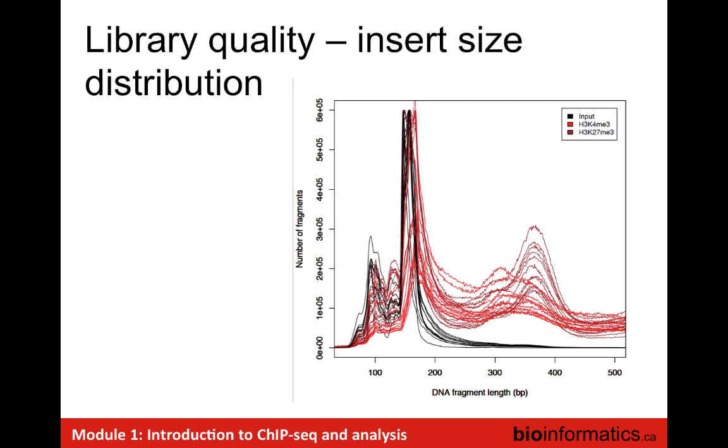Say that again? You do an enrichment on certain fragments depending on the marks that you're looking at. Right. So that's interesting, right? So for example, though you can't see the difference in shades, you can see that actually K27 trimethylation, right, Polycomb, is enriching for bigger fragments, larger fragments. Even though this is what it was presented with, this is what came out, right? And remember that we're giving it a distribution of fragments, right? And so of course these fragments were present in the input library, but at a very low frequency. And in our IP, we've actually highly enriched for those, right?